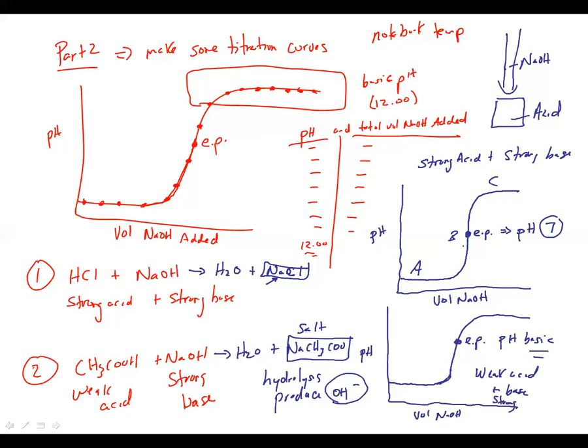So make sure that you do label those different parts on those curves. For some reason, people always miss that part of it. So again, make sure that you go through the data analysis part and answer those questions and label the graph, not only with the proper axis labels and so on, but also include on your graphs the points that they ask you to label. So make sure you don't miss any of those as well.